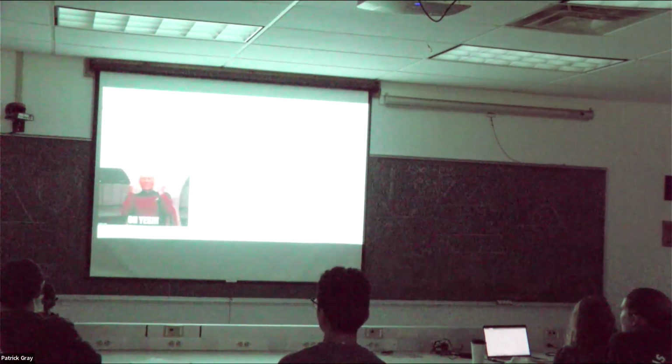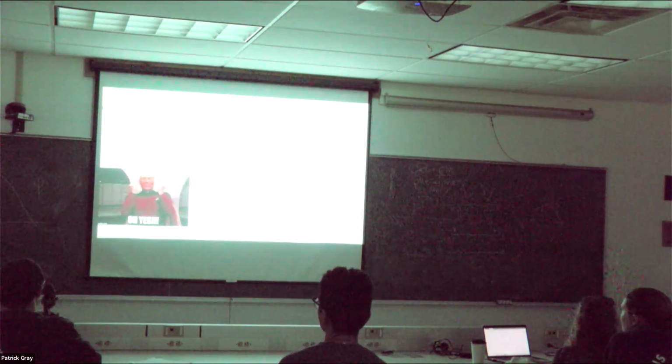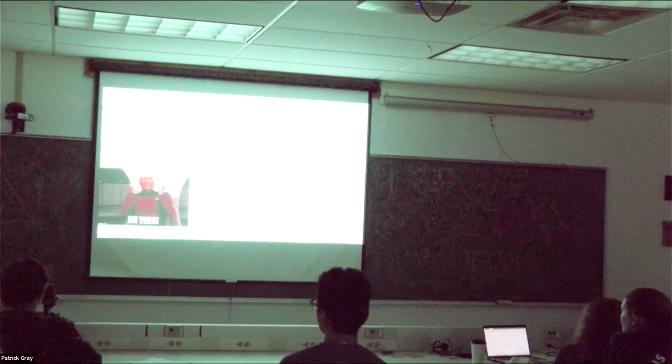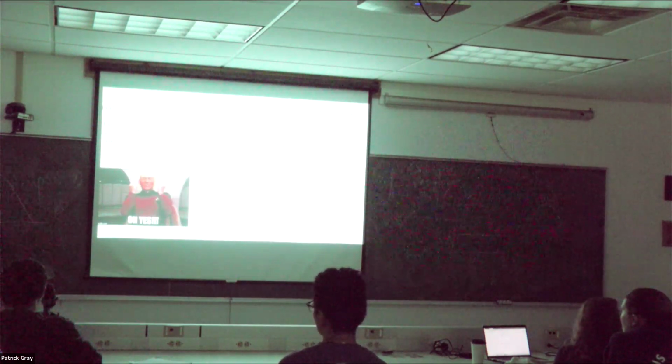Okay, but what I wanted to get to is that you're going to be doing this today. You're going to be extracting your chlorophylls, dropping it in acetone, and looking at the measurement.